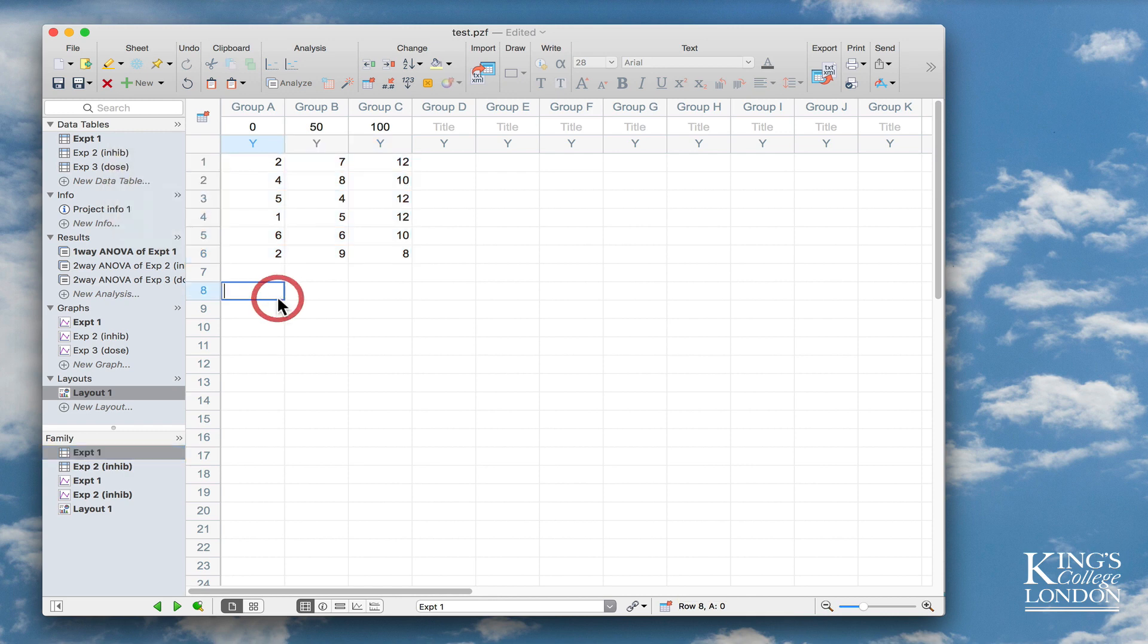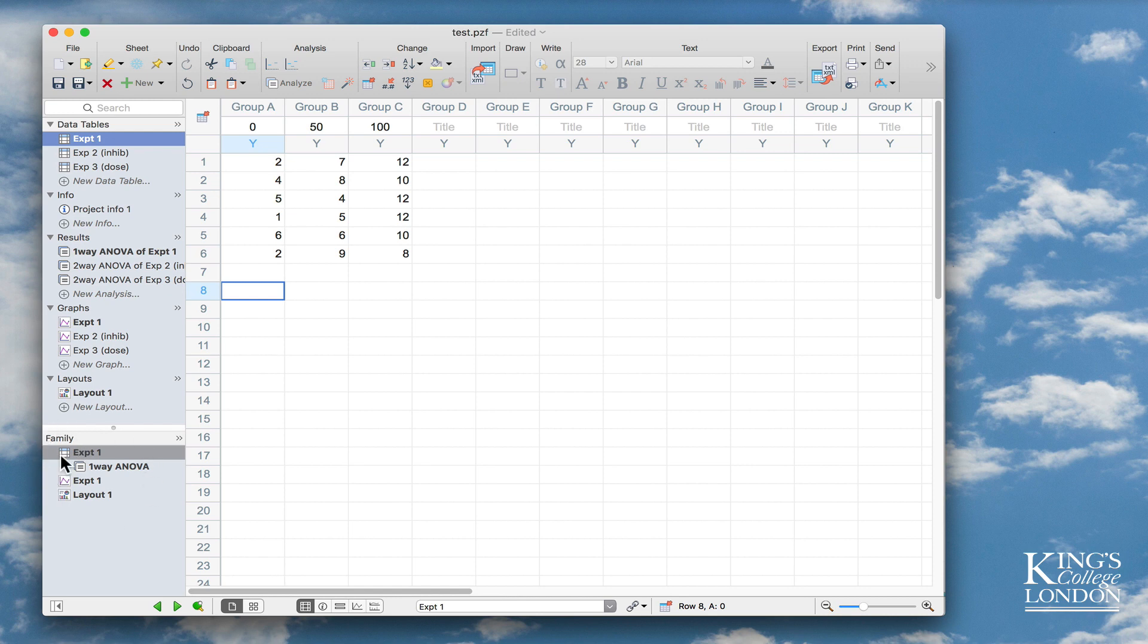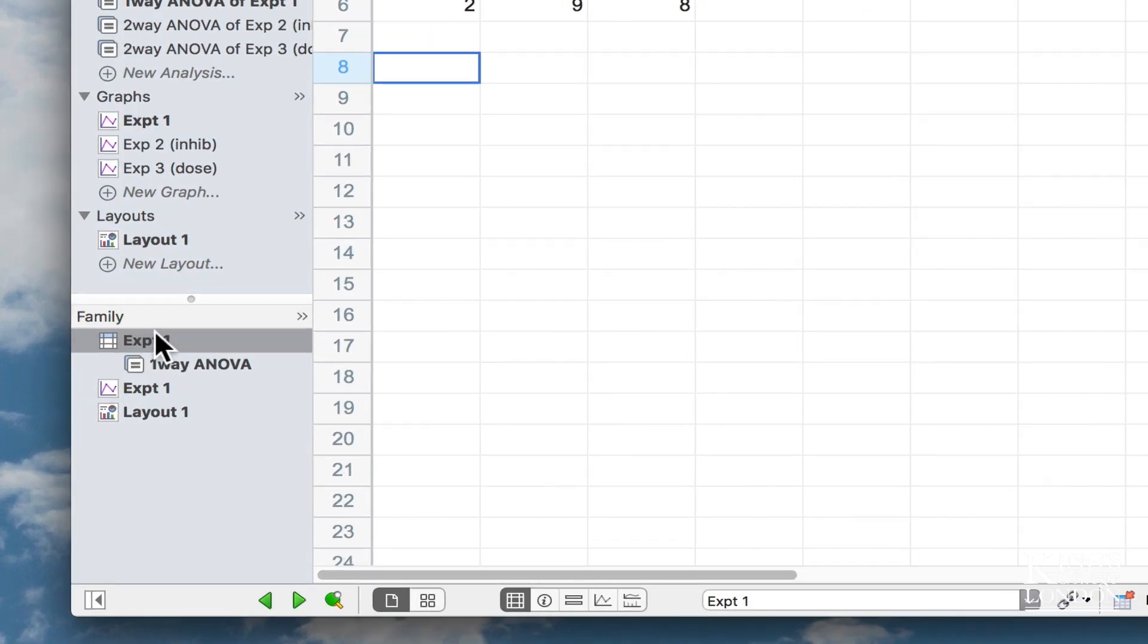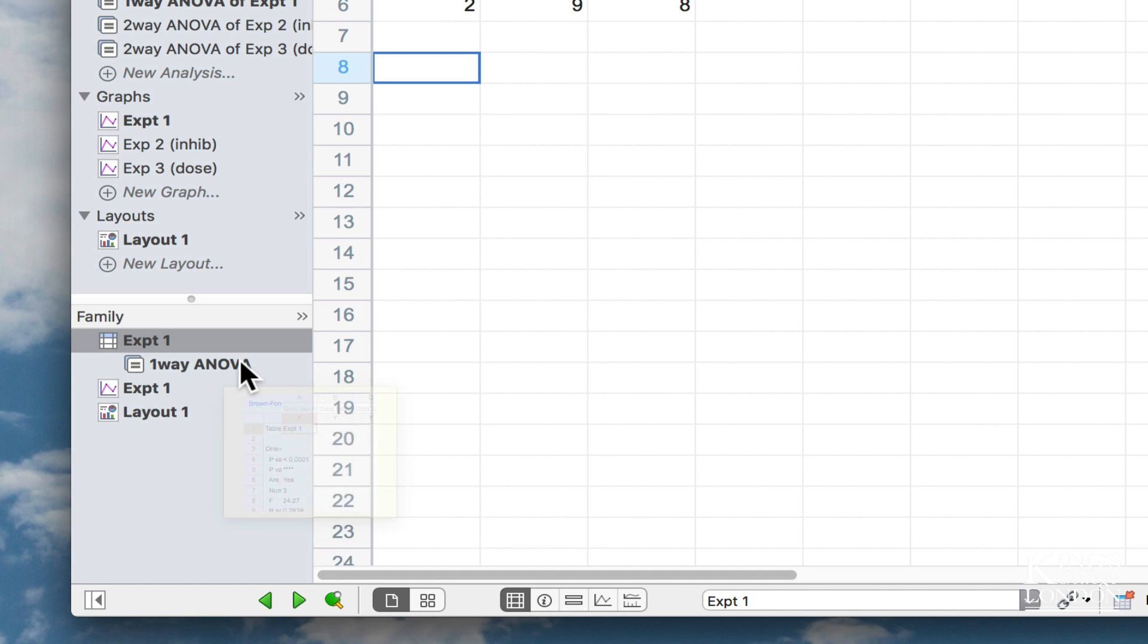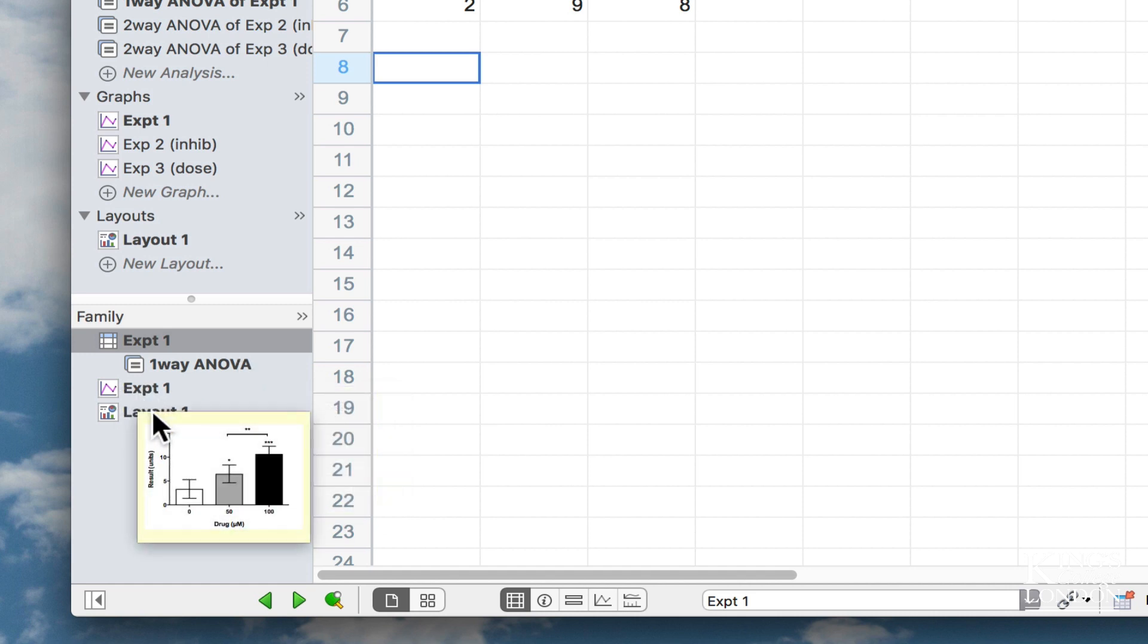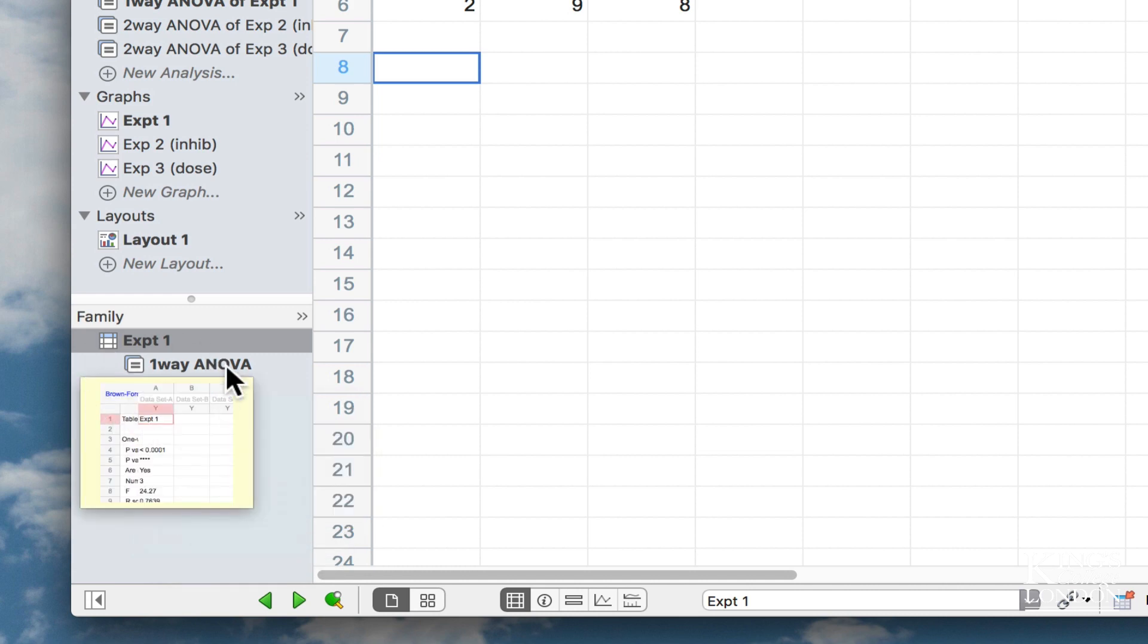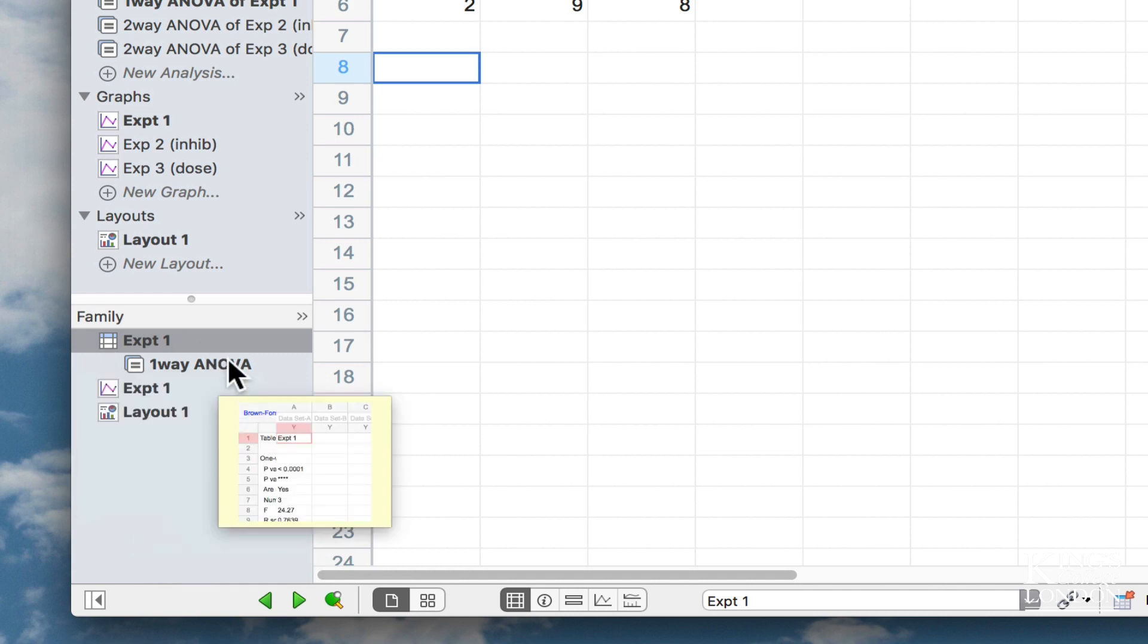As before, now I'm in EXP1 table, you'll see that the family has changed, and now tells me that the EXP1 table has a one-way ANOVA as part of its little family, and also the EXP1 graph and Layout 1 appear as part of the family.